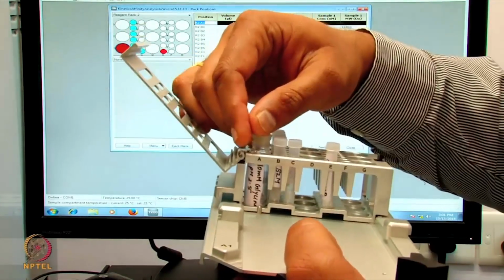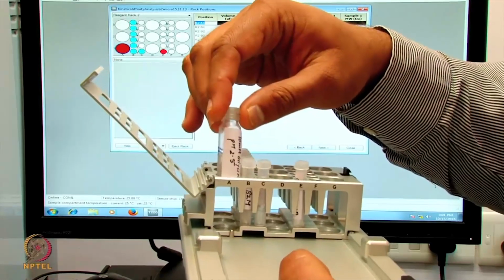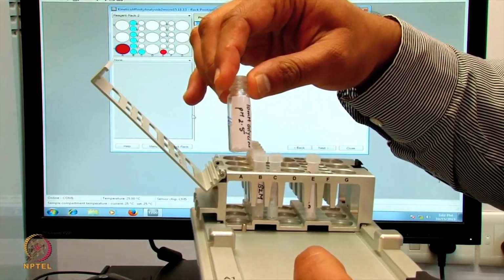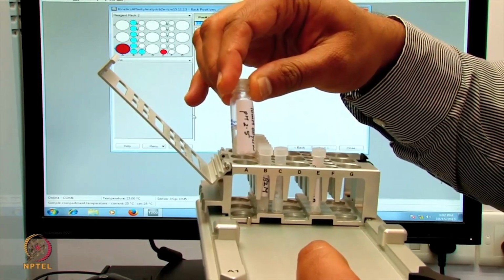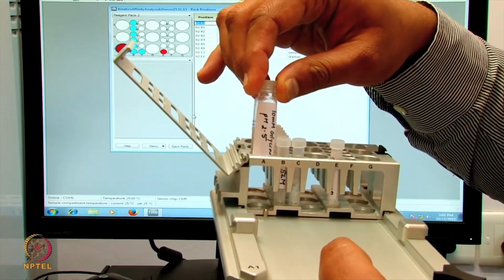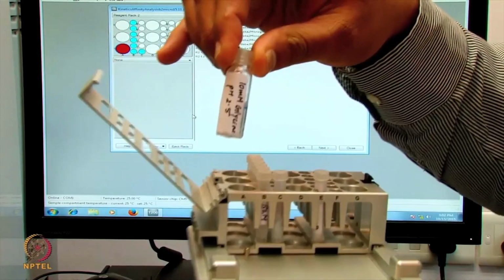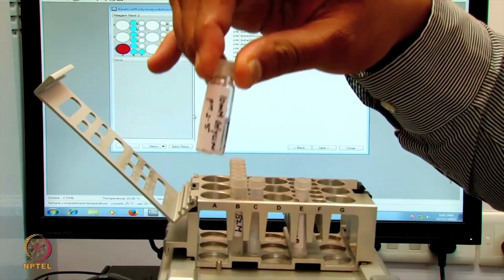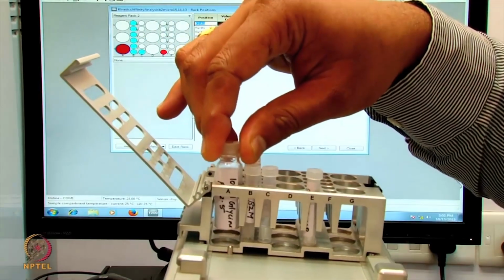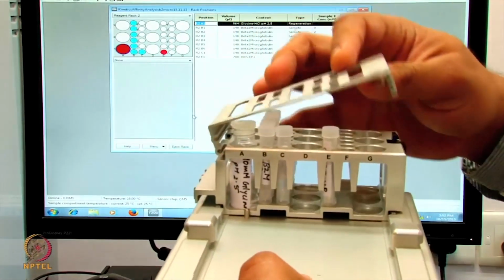Once we have placed them, we will also have glycine 10 millimolar pH 2.5 regeneration solution put at the A1 position. Now we close the rack.